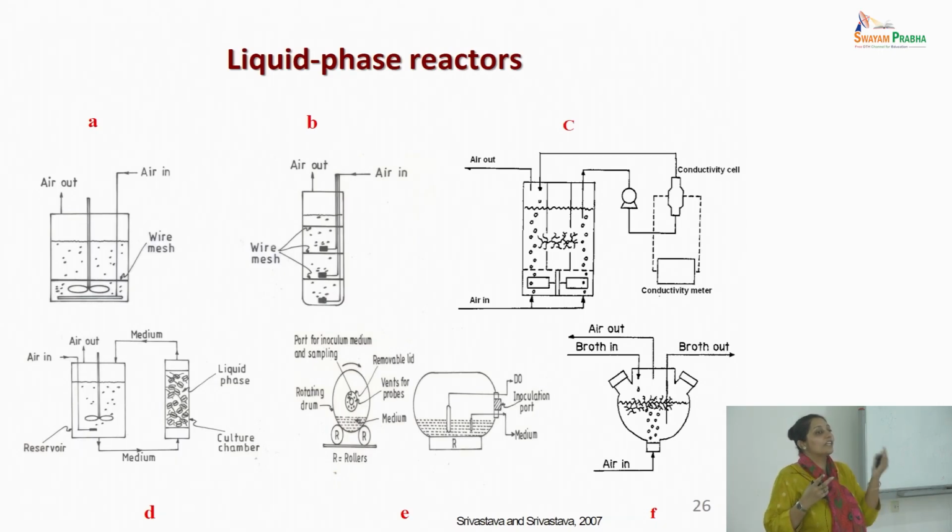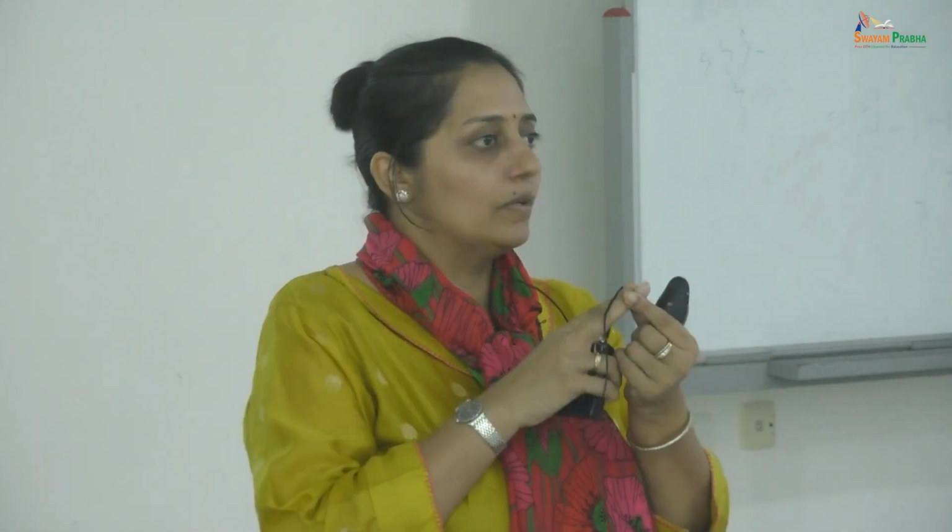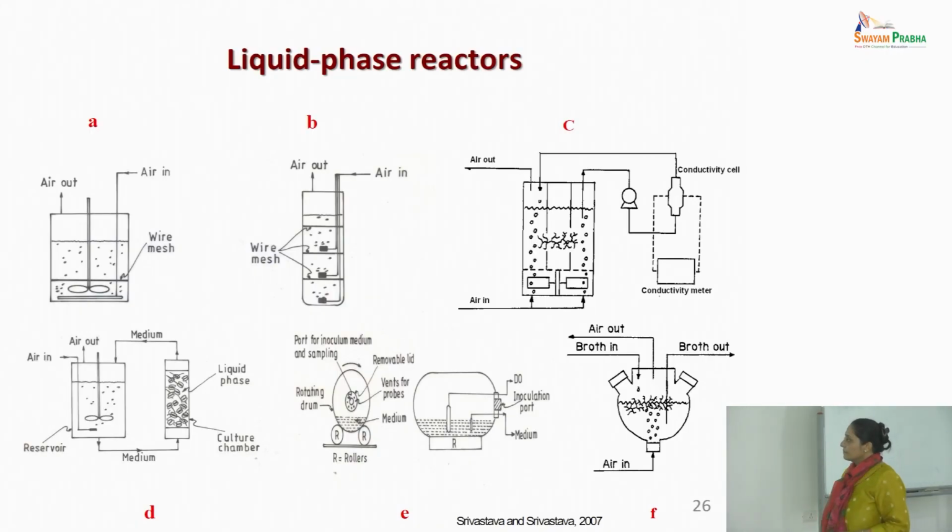The way out is that when you are initially inoculating, you divide the inoculum into much smaller parts. Let's say you are working with 10 grams per liter of inoculum, I'm giving you a scenario. Why don't you divide the inoculum in the same reactor into 2 into 5? Which means have a support for 2 grams, another support for 2 grams. People have come up with designs where they have segmented the reactor, and you will have come across various designs to meet the culture requirements in the literature.